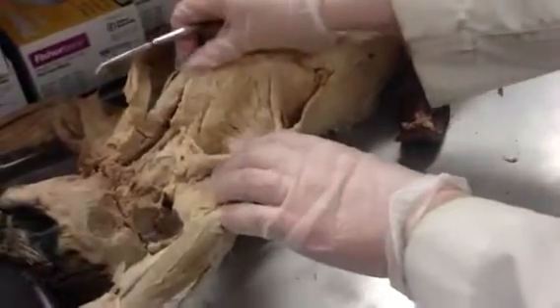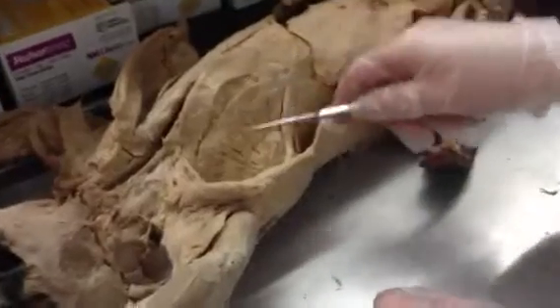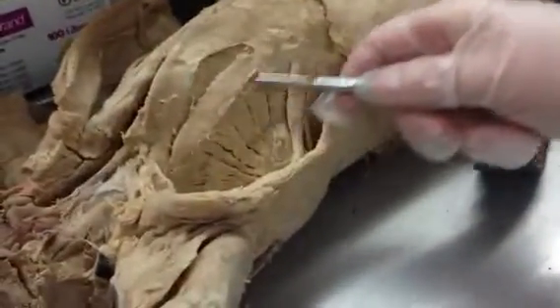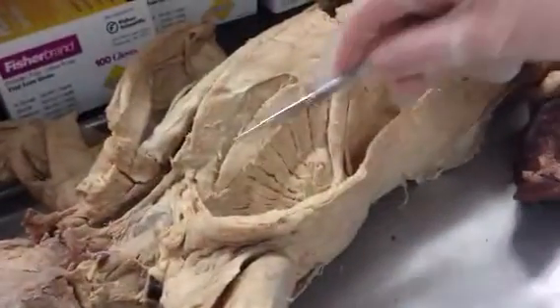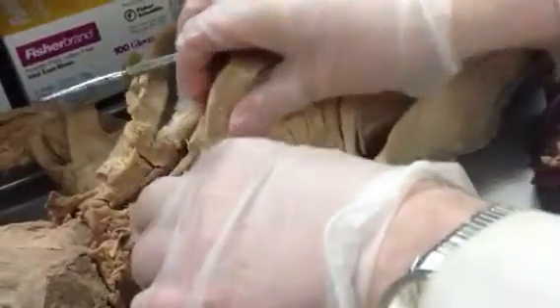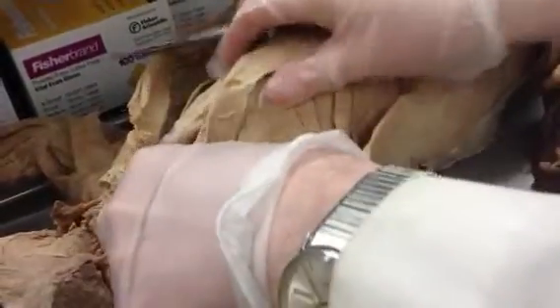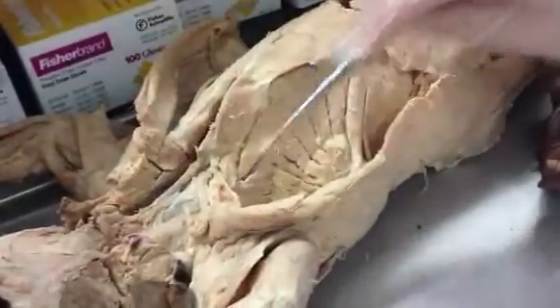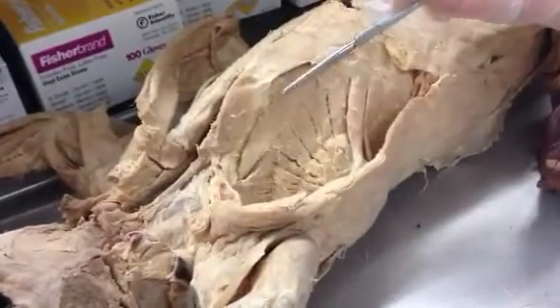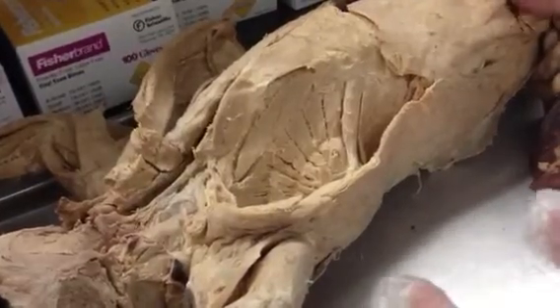And then here you can see part of what we call the arrow — the scalenus muscles. The middle part of the arrow is called the scalenus medius. The part towards the belly is called the scalenus anterior. And the part towards the back of the cat is called the scalenus posterior. When these three scalenus muscles come together, one, two, three, that's called the scalenus group.